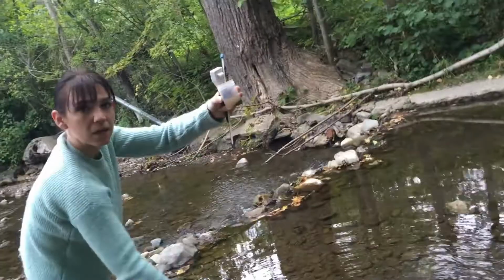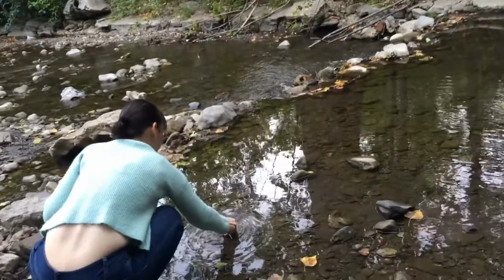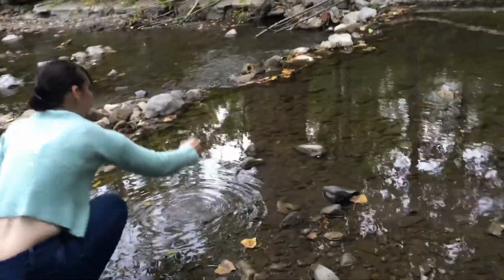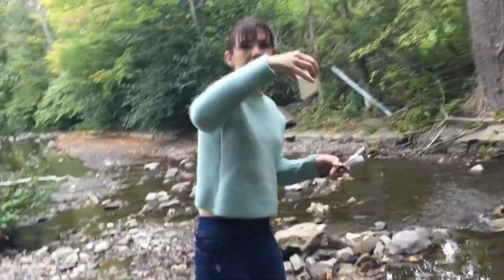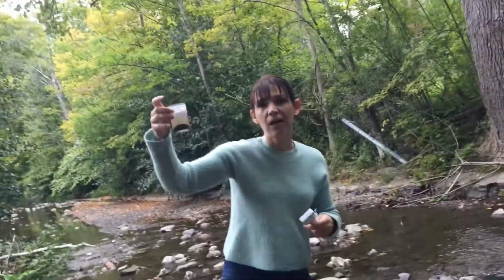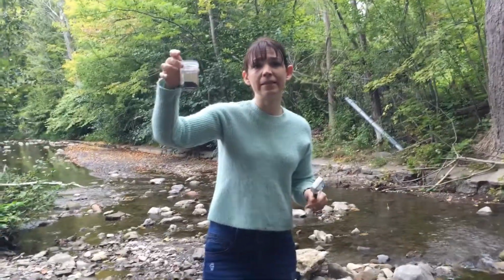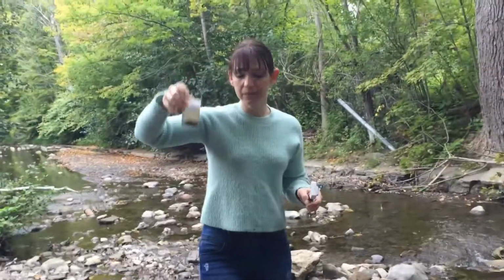So now we have some suspended sediments, and then I'm just going to add some more water. All right, so that's going to be my sample that we're going to test for the micro and macronutrients, as well as the nitrates, the phosphates.